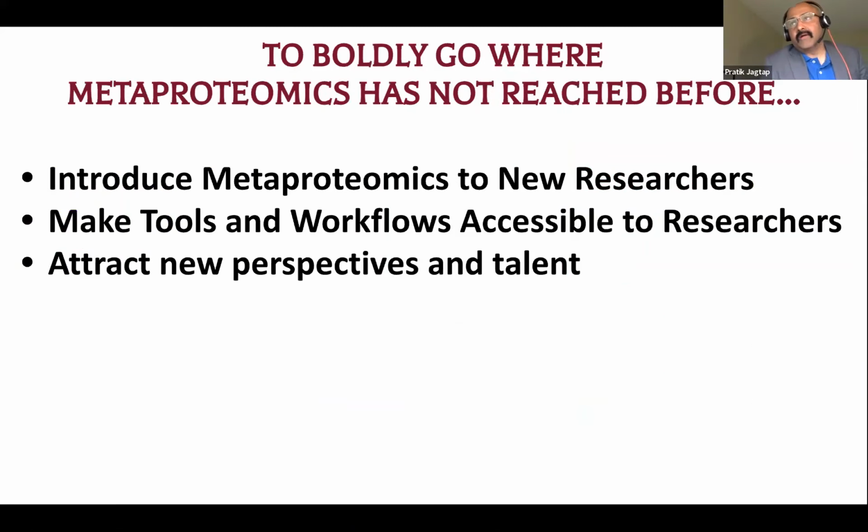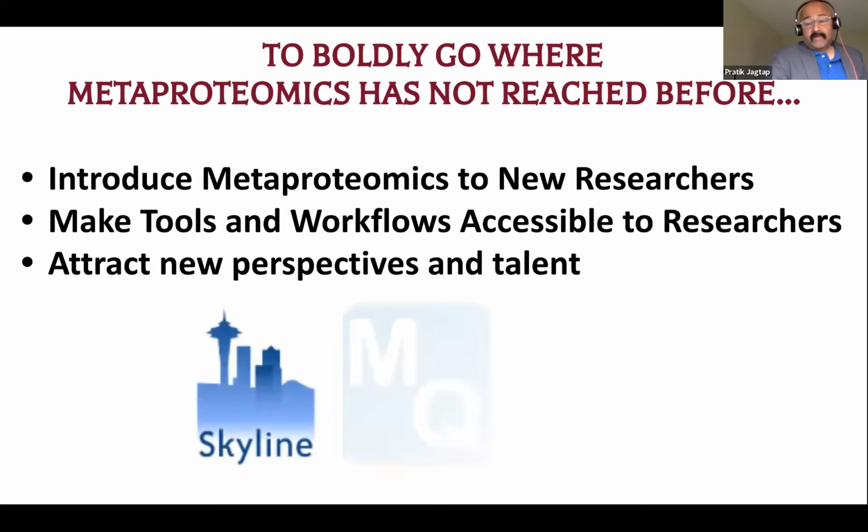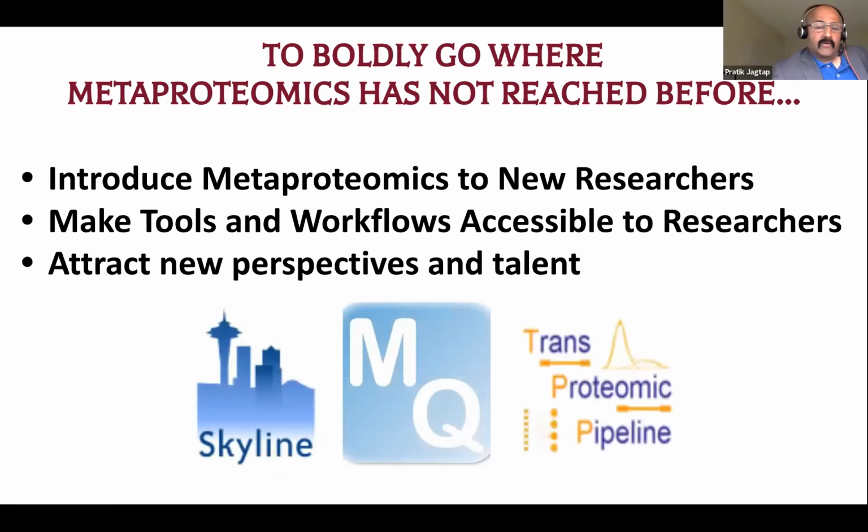So with this in mind, for the last 5 years now, we have been holding quite a few tutorials, both in person as well as online, to introduce metaproteomics to new researchers. We also hope that this will make tools and workflows accessible to researchers and hopefully attract new talents and perspectives. This is in line with some of the other tutorials that some of you might have attended. There's a Skyline tutorial. There are summer tutorials in MaxQuant, and I think Transproteomic Pipeline also has some workshops. So we hope that we'll have regular metaproteomics workshops as well.